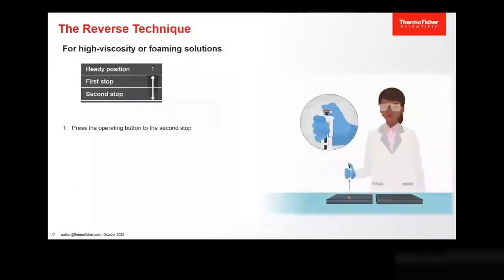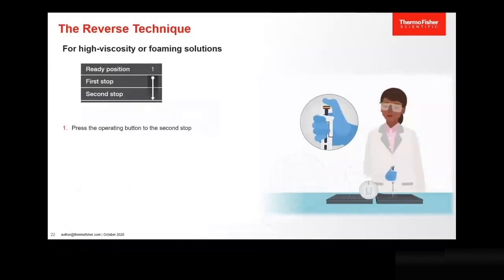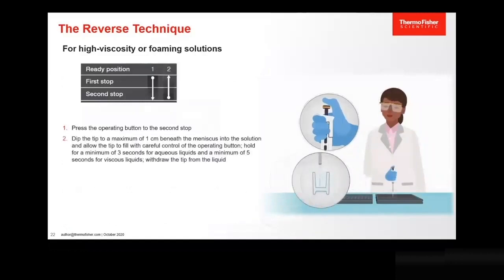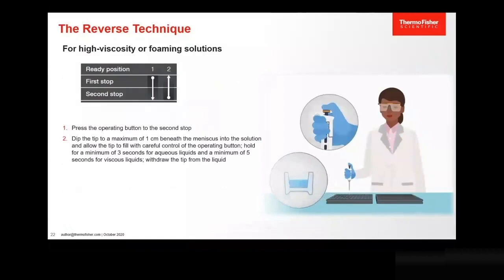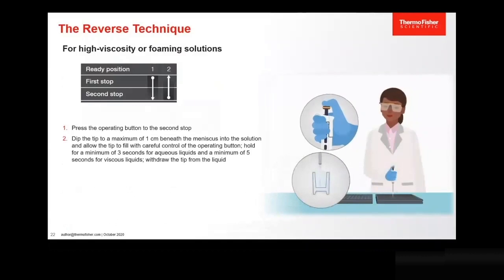The reverse pipetting technique for high viscosity or foaming solutions. Press the operating button to the second stop. Dip the tip to a maximum of one centimetre beneath the meniscus into the solution and allow the tip to fill with careful control of the operating button. Hold for a minimum of three seconds for aqueous liquids and a minimum of five seconds for viscous liquids. Draw the tip from the liquid.